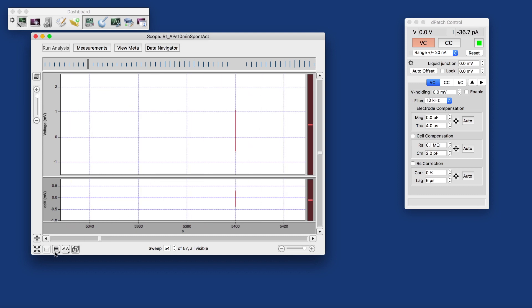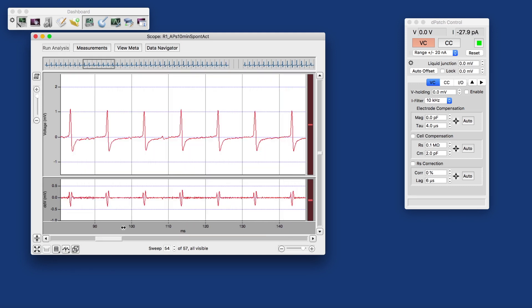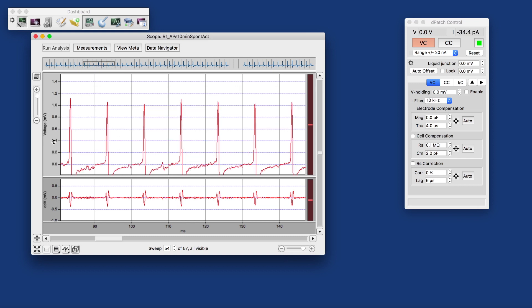That's why it may make more sense to look at that in a concatenated display, where the gaps between the individual sweeps — the 10-minute-long gaps — have been replaced with vertical lines. We can zoom in on both the x-axis, as you have seen, and also the y-axis by just dragging along the axis.